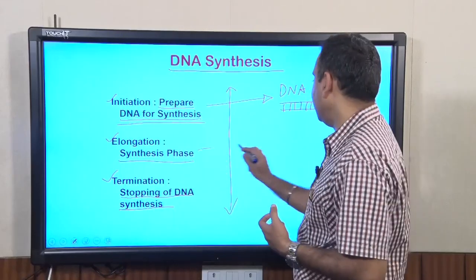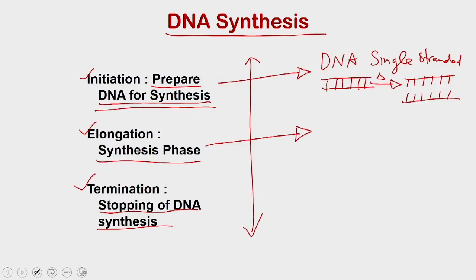Now, in the second step, while it is in the high temperature state, you will add the primer, okay? Just as it is added in the initiation stage of DNA replication, you add the primers and allow these primers to bind to your template DNA.